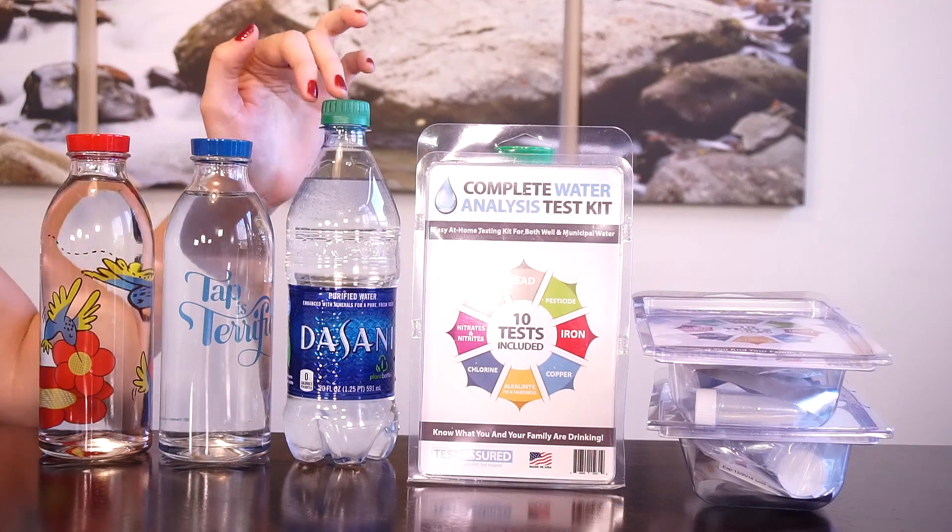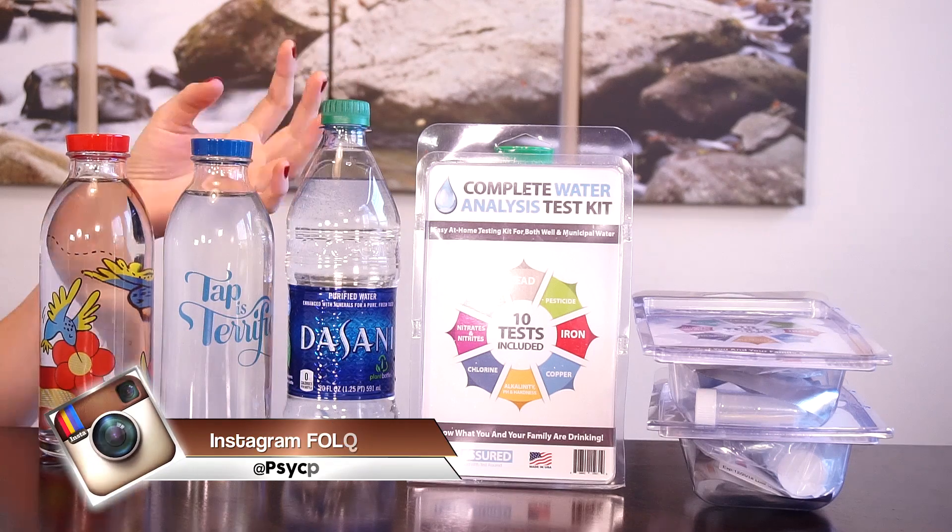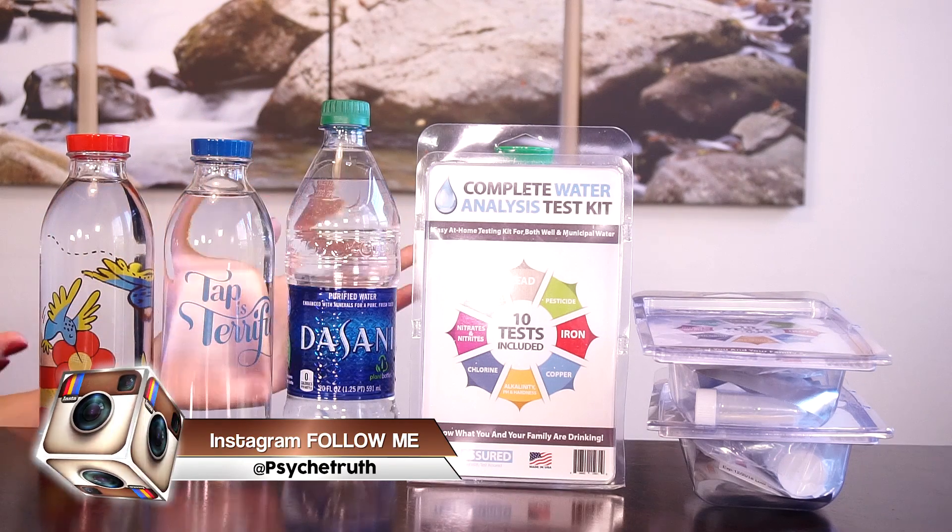Now let's get to the water testing. These three water sources should end up being pretty close to one another because they're all drinking waters, but I thought it would be interesting to really see how they measure up and to see how effective this water filter is compared to the bottled water.